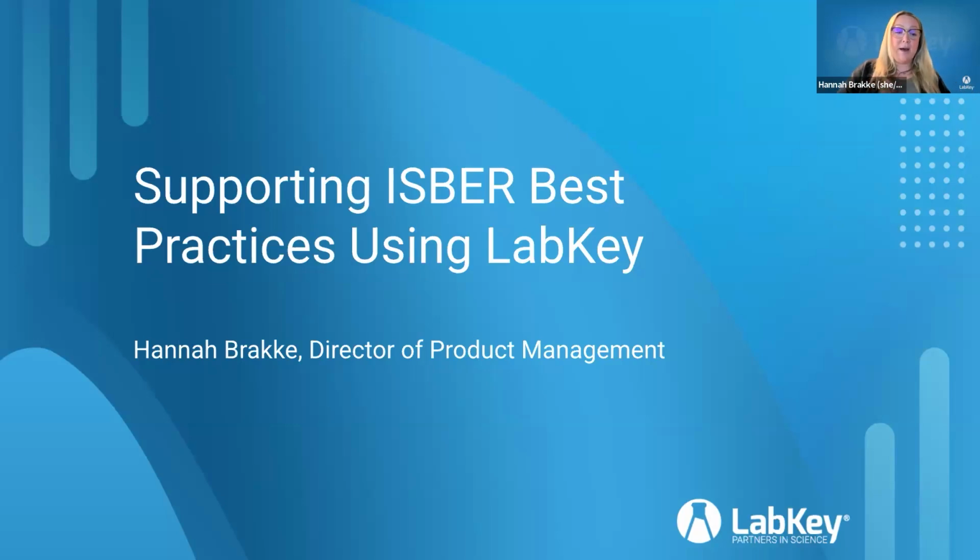So I've run the gamut in the types of samples, as well as using all types of systems from varying degrees of both complexity and formality for keeping track of these samples and their locations. So by no means am I an expert in this space. However, I do have a good foundation of these challenges that biobanks are facing as they're striving for quality and reproducible sample management processes.